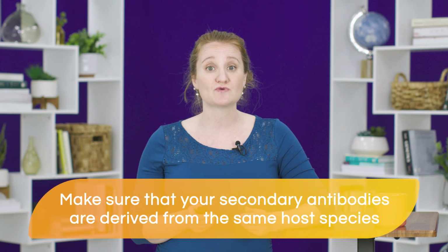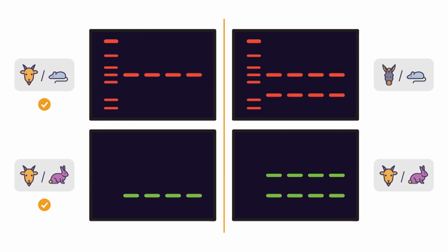Also, when you're choosing secondary antibodies, if possible, make sure that the secondary antibodies are derived from the same host species. For example, you'd want to use a goat anti-mouse and a goat anti-rabbit secondary antibody to eliminate the chance of the secondary antibodies interacting with each other. If you use two secondary antibodies that are derived from different host species, such as donkey anti-mouse and goat anti-rabbit, they could potentially interact with each other. The secondary antibodies are interacting with each other, and that's leading to the band that's present in both channels.